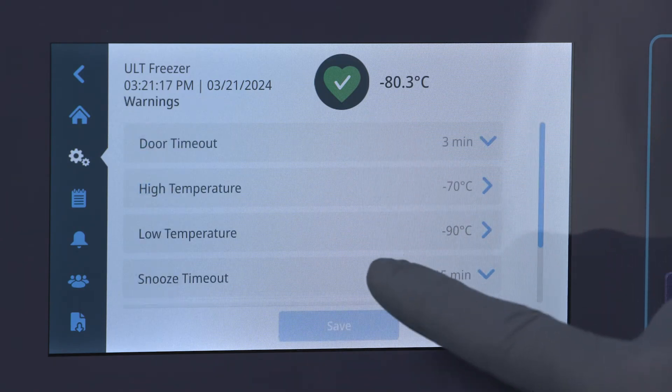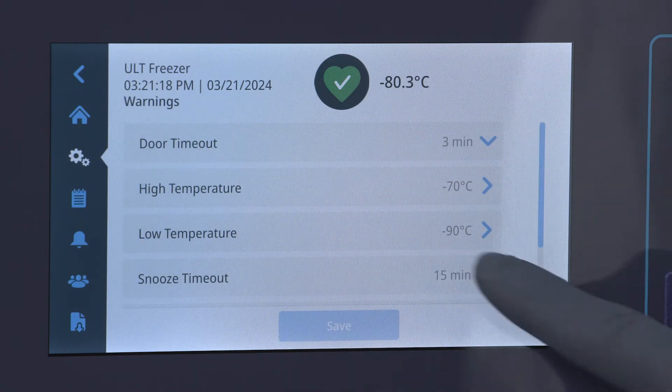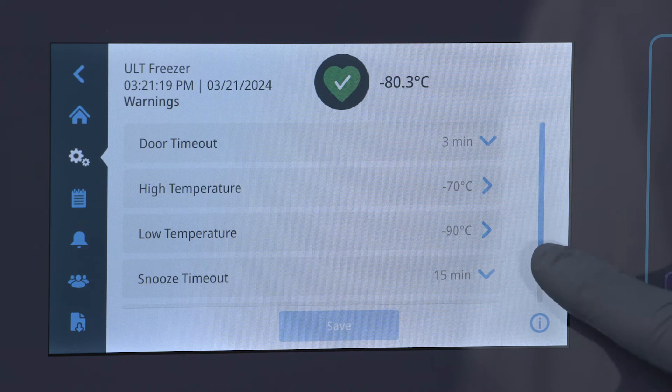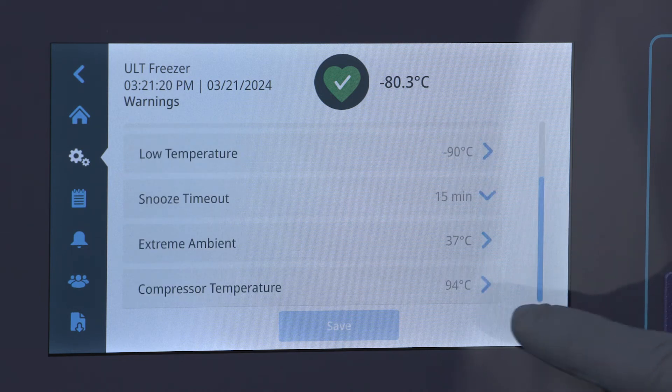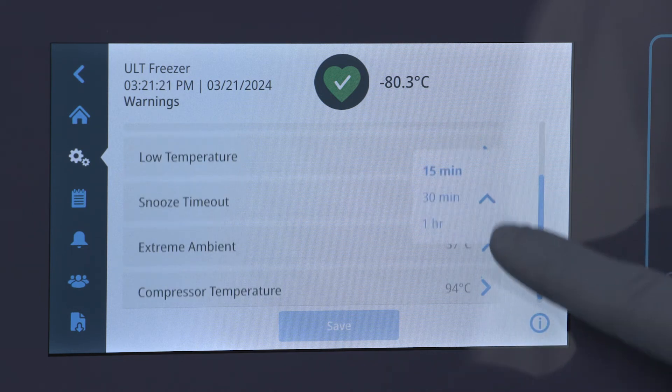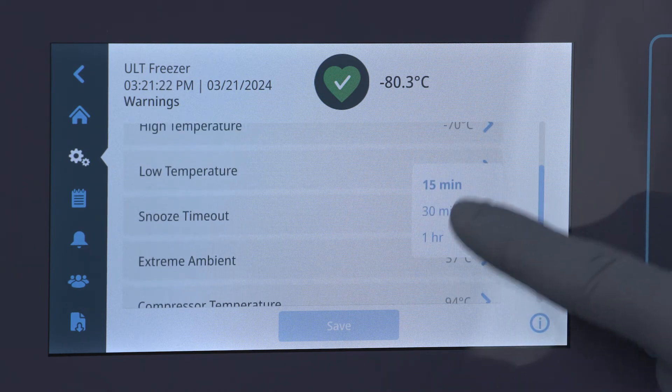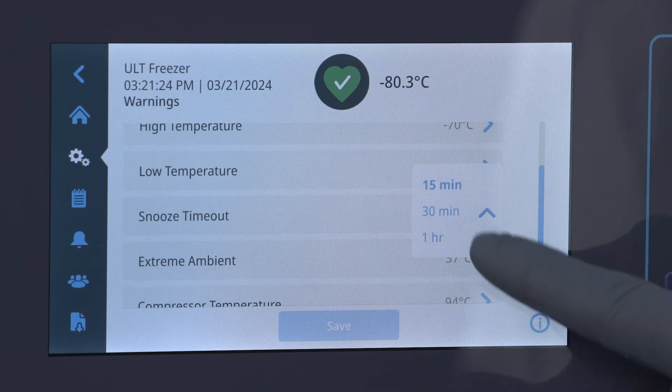When a warning initiates, you have the ability to snooze the audible alarm. Snooze timing is fully adjustable up to 96 hours.